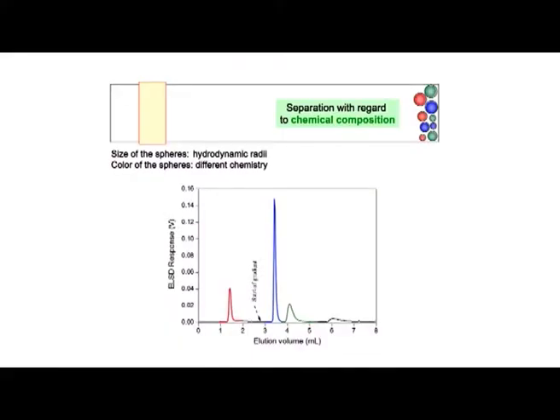As you can see, firstly the red colored balls are separated, and you get a nice separation, or an individual red peak, on the chromatogram. Then next are the blue colored dots, separated according to their chemical nature, and as I explained before, there is a slight dependence on the molar mass. Other than that, we have a nice separation of the individual components in the HPLC chromatogram. As you can see in the chromatogram, we have a nice blue peak there.